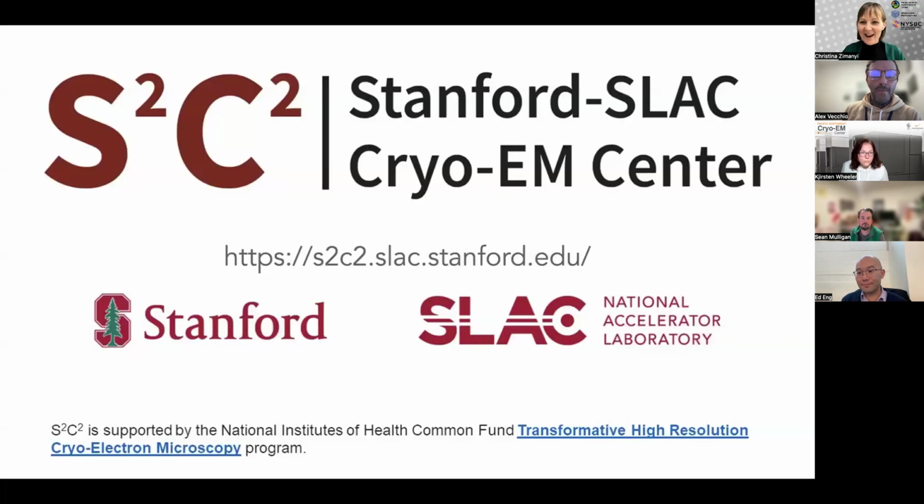Thank you, Ed. And we'll have to provide you a quick update from S2C2. So similar to the other centers, S2C2 has access to instrumentation for data collection as well as training. They have regular working groups for their trainees with data processing, and all of the information about their access categories and applying for time is at their website that you can see here. So check out S2C2.